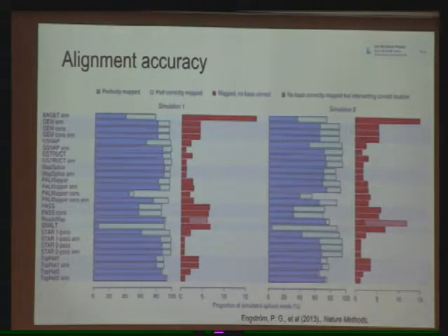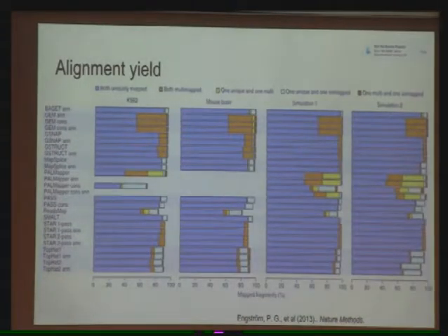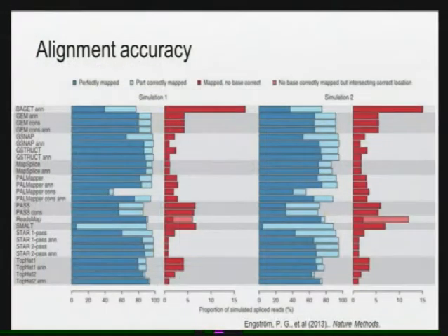Quick question. And maybe you'll go over this, if you are, just let me know. Is this specifically genome mapped reads, or is this genome and transcriptome, and is the junction mapping included? Let me see. I'm trying to remember if they did a genome or transcriptome alignment. That might vary based on the tool, because they work differently.